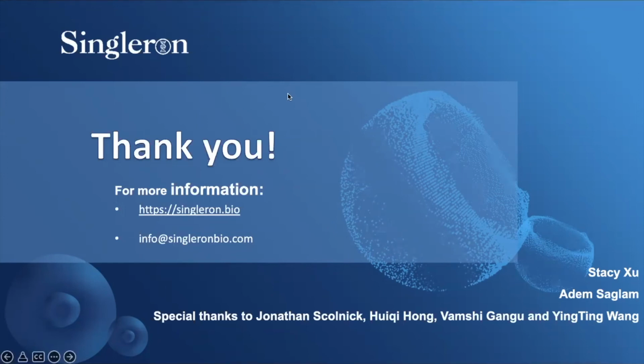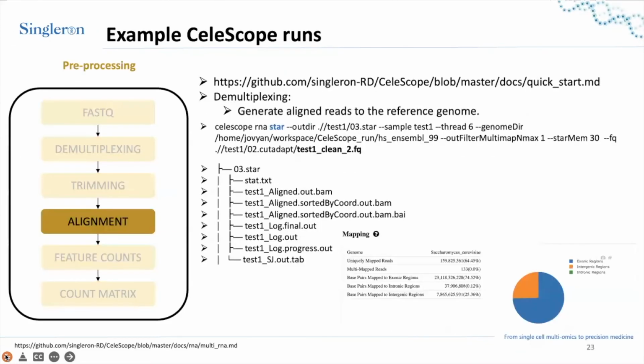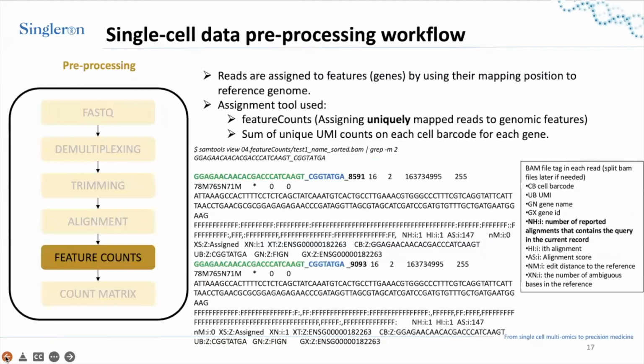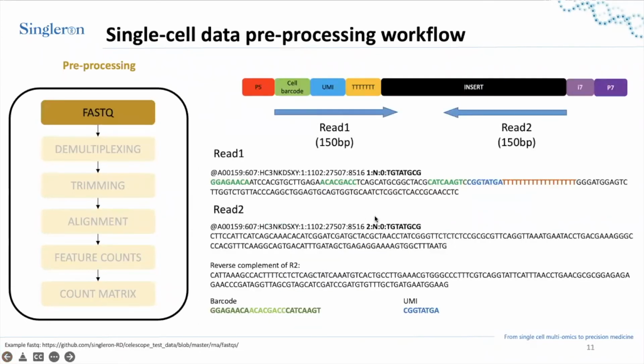Relating to Fastq files, does the range of quality scores depend on the sequencing platform used to produce the Fastq file? Let's go back to the Fastq file page. I think it's a very interesting question.